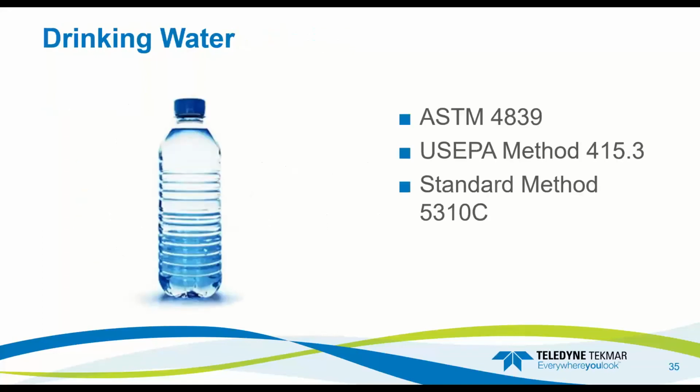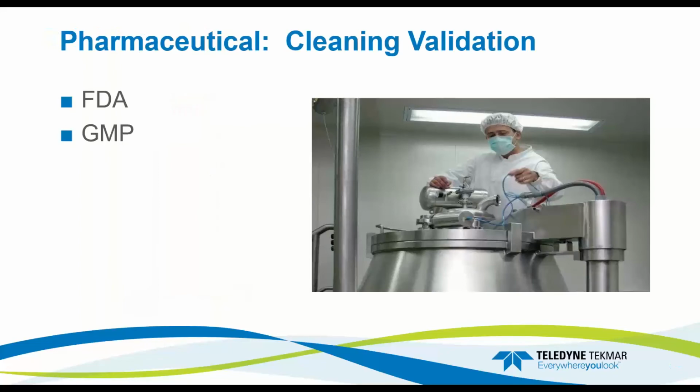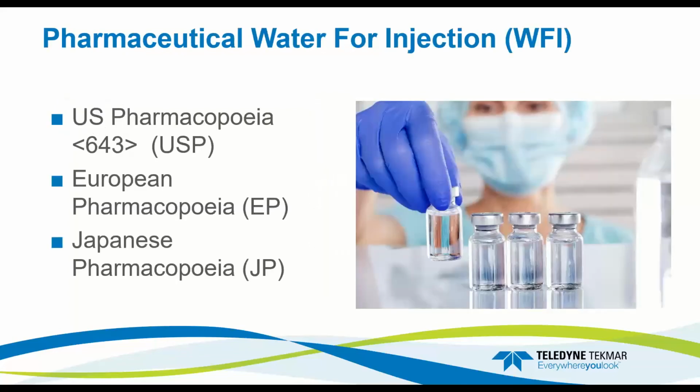So when we start looking at this, yes, I talked about how this system can be used for drinking water. If you're looking at drinking water methods, these are what it's standardized to. But within the pharmaceutical cleaning validations, we go after the FDA, GMP, even USP 643, the European pharmacopoeia, the Japanese pharmacopoeia.